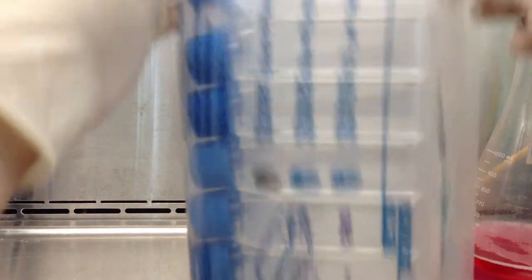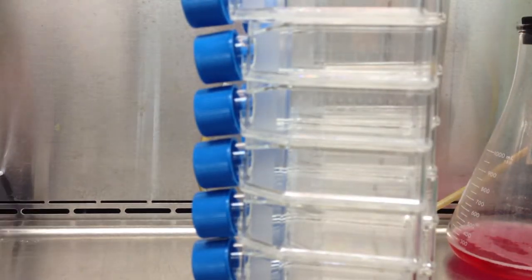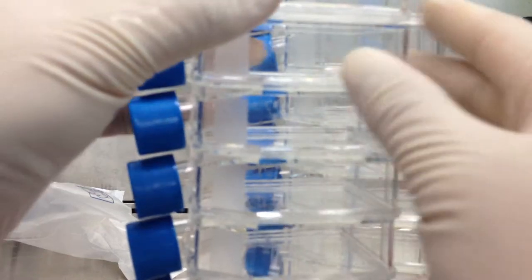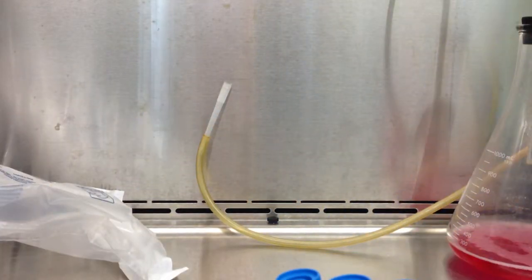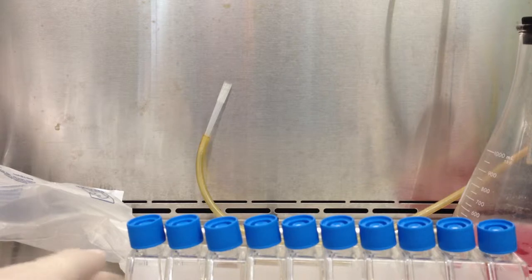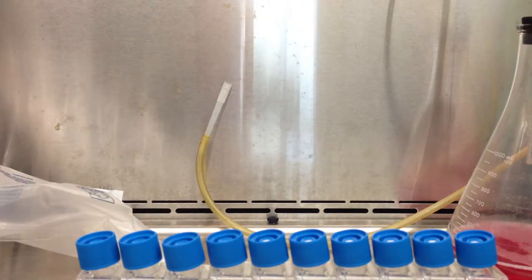Notice, I don't centrifuge to get rid of trypsin. Trypsin is naturally deactivated by the media, the bovine serum. And because I use so little trypsin in such a small concentration, the amount of media that I introduce deactivates the trypsin. Also, in this case, normally I split 1 to 20, but in this, I will be splitting 1 to 30, so I don't have enough flasks here.